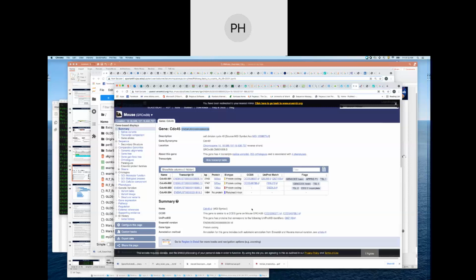Awesome. Okay, so what I did here is I just have the gene on top and the length that was reported in the RSEM file, as well as the effective length, and I'll get into that in a minute. And so we have the 4 transcripts for this gene, and this is just the length in base pairs that I put there based on that Ensembl length that I just showed you guys, but of course that can also be calculated from the GTF file, and in fact that's how RSEM does it, because that's what we give it, the GTF file.